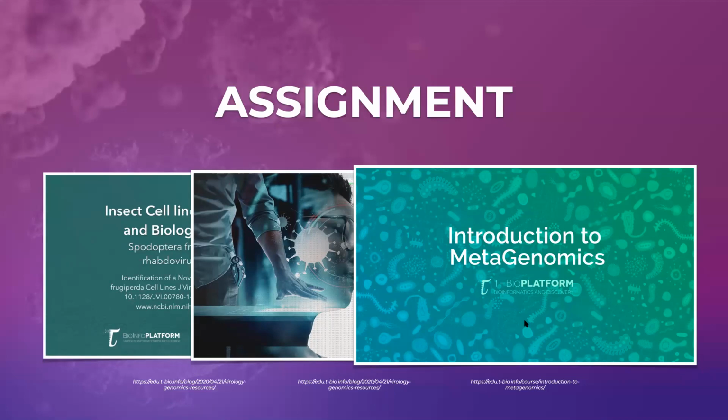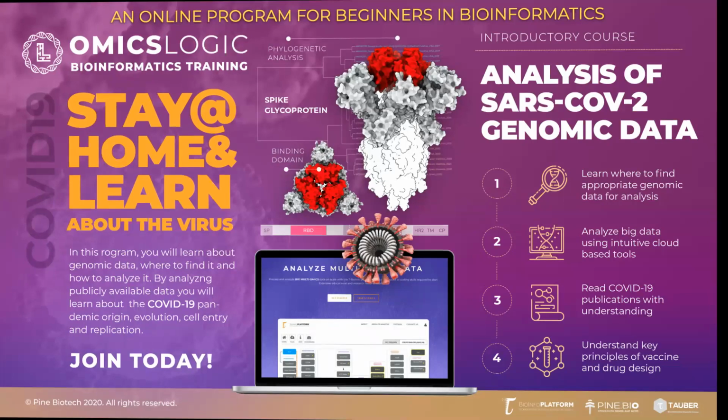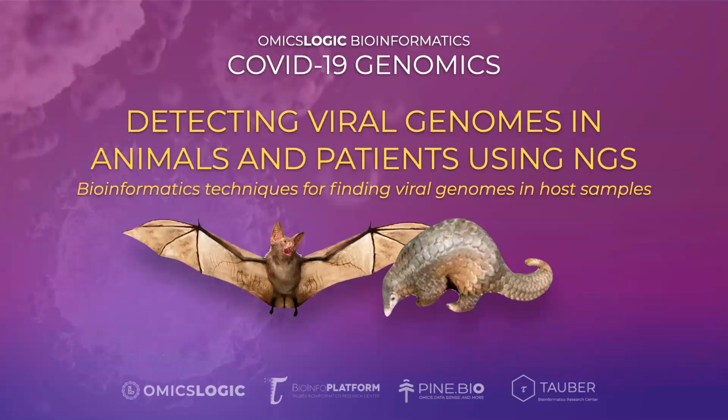in greater detail. Okay, so I'm also going to briefly give you an overview of the program schedule and the different sessions that we'll have and what we'll learn in each session. In today's session, we talked about sequencing and how sequencing is being used to study viral genomes. Then we'll start talking about finding specific viral genomes in animals and patients using next generation sequencing. So how do we actually take a sample from a bat or a pangolin or a human and identify what kind of a virus is inside?